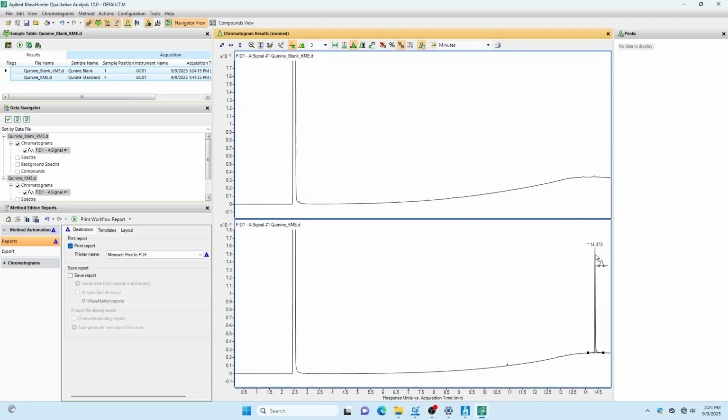When you've got everything set with the scale, you want to make sure that you have a good number for the peak. We don't need the area or anything, but a nice peak label is good. It should be already integrated. If it's not, you can just drag across the baseline at the base of the peak, and it should integrate the peak for you and put a nice label on it.